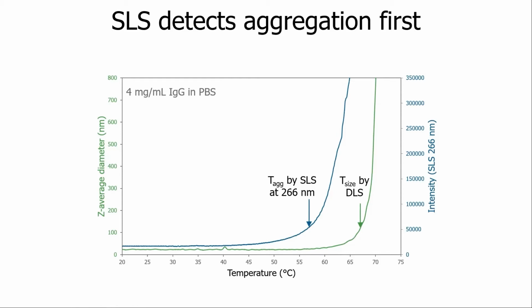So this confirms what we saw in the previous experiment, where SLS easily picked up on what was a minuscule size change for DLS. That SLS sees changes in size more sensitively than DLS. It'll pick up on size changes before DLS does.